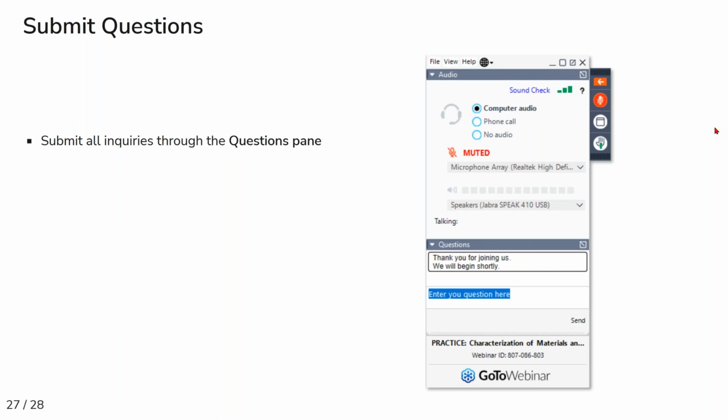So my thinking is probably for cytosolic samples, we will need to find a way, basically with markers that are genetically introduced. That could be RNA folded structures that might show up very well on cryo-EM data, or there are some ideas of metal binding proteins that are basically creating high contrast features. So I think there's still a lot of ongoing research, and it's not quite clear what the eventual best approach will be. All right, thank you, Johannes.